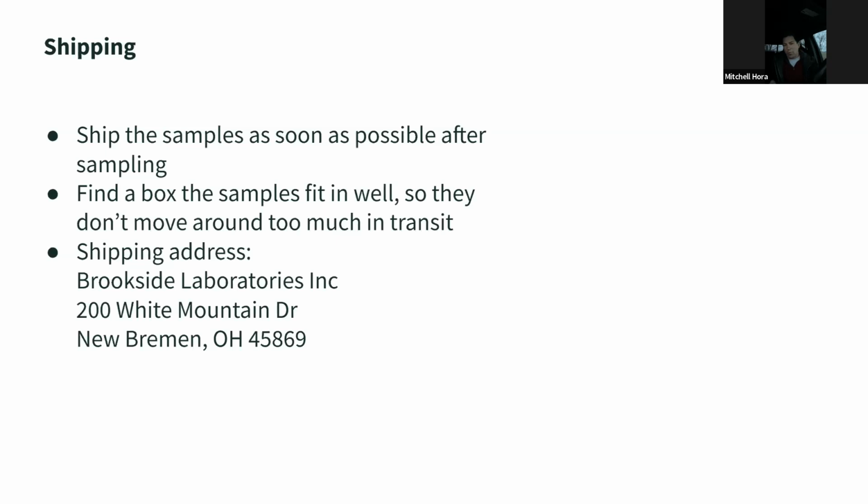Usually what we do is use a flat rate box. You can do the small flat rate shipping from the post office. They're a couple bucks, not a huge deal. Or you can do a regular box, whatever you want to do. You might want to tape the bag shut to make sure it stays nice and closed. We typically just use packing tape, just like to put it together in the box.